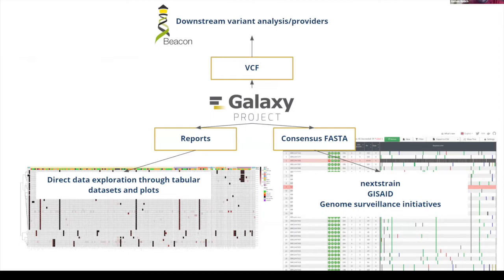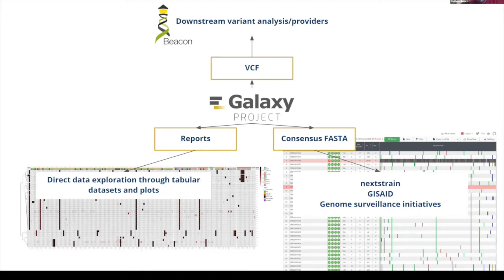This gives us a list of variants. We can output these variants and use them to do a number of interesting things. We can generate consensus FASTAs, generate VCF files and feed those to downstream variant analysis tools, and generate reports for data exploration. Some people in the COVID Galaxy group have been putting together Observable notebooks that can do interactive analyses of these in real time in a web browser.